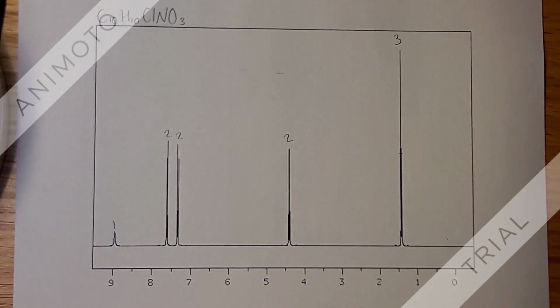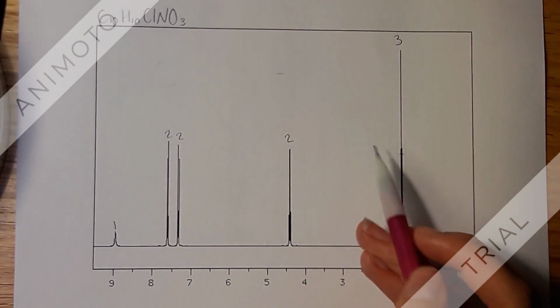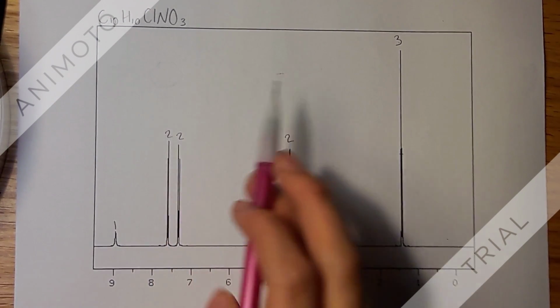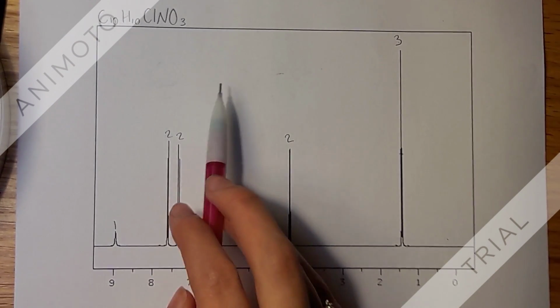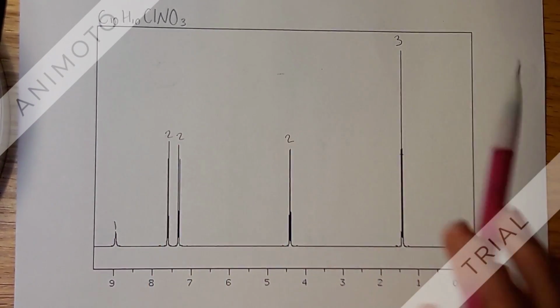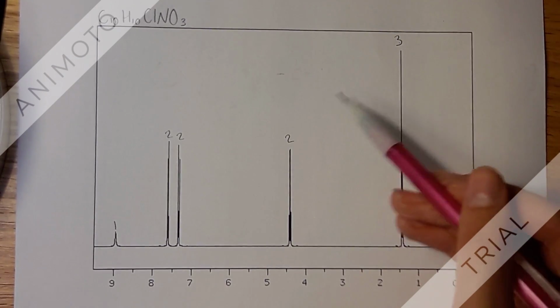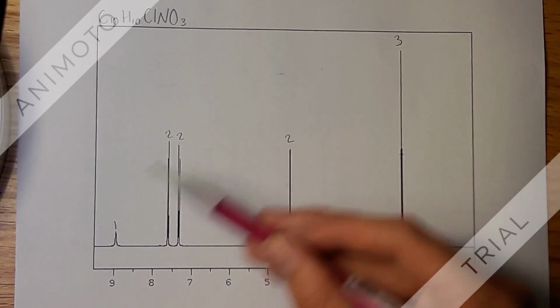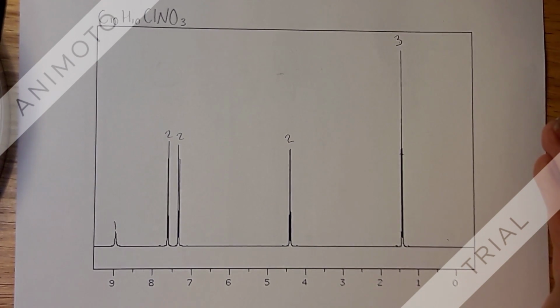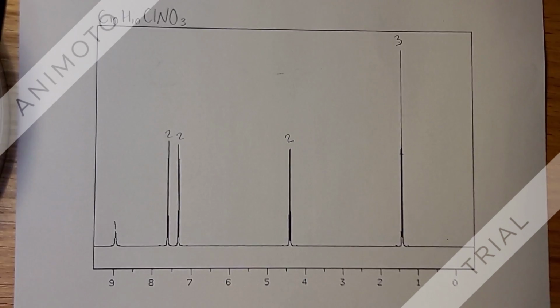So the next graph that we're going to look at is the proton NMR graph, and that graph looks at the hydrogens attached to the atoms within the structure. And this is how we're going to tell the formation of our molecule in the way that the structure is. We're going to do this using the integration numbers of the hydrogen, and we're also going to use the n+1 rule, as well as the information that we found out from our last 2 graphs.